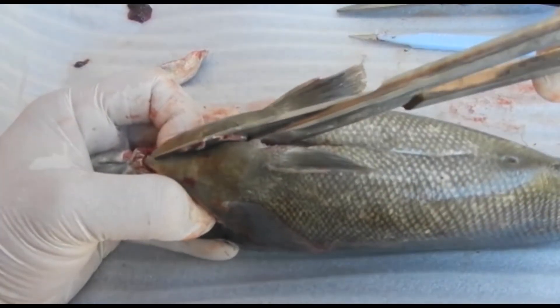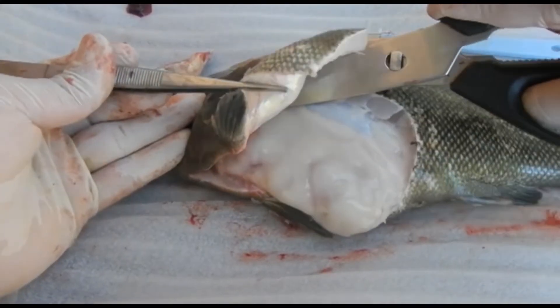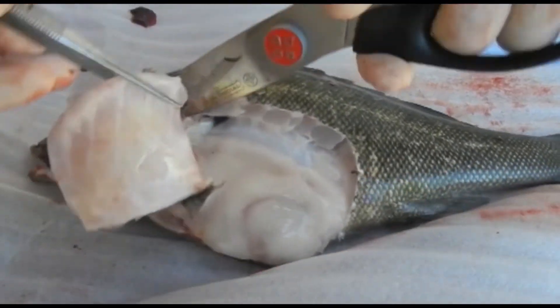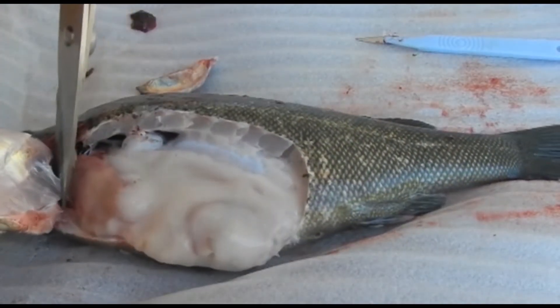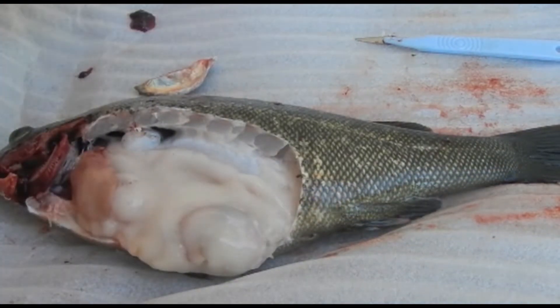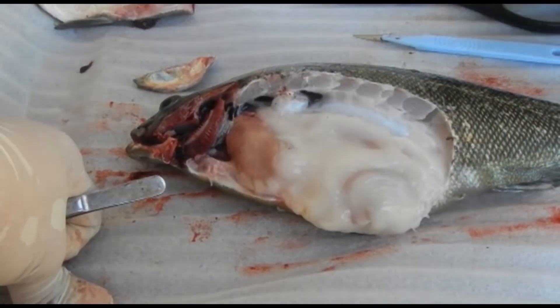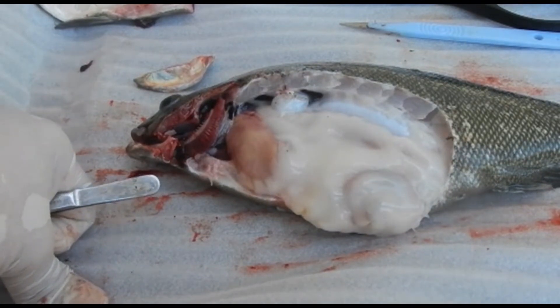We extend the incision forward or cranially, then up and around, using the largest set of scissors to cut through the bones. After removing the last body flap or wall, you now have the fish open. That body flap can actually be used as a sterile surface if you are out in the field without one.